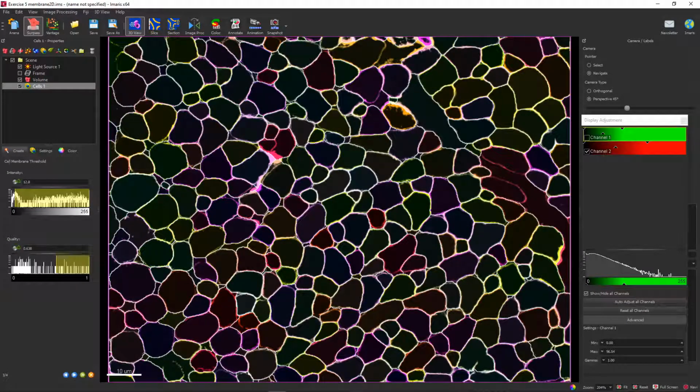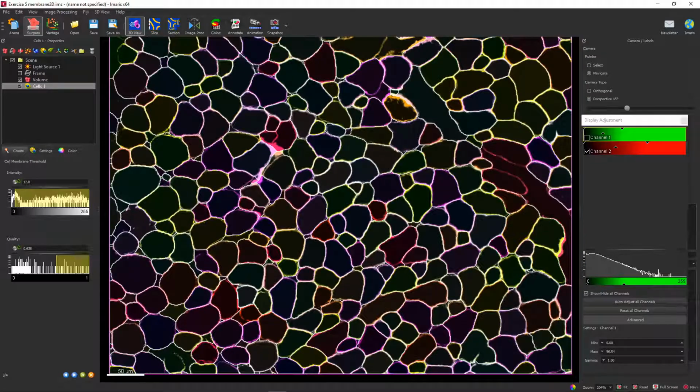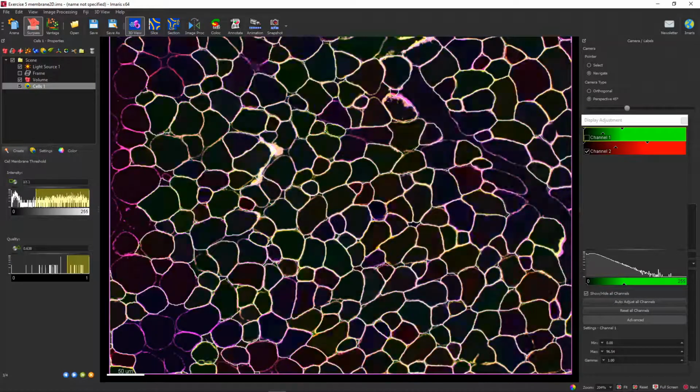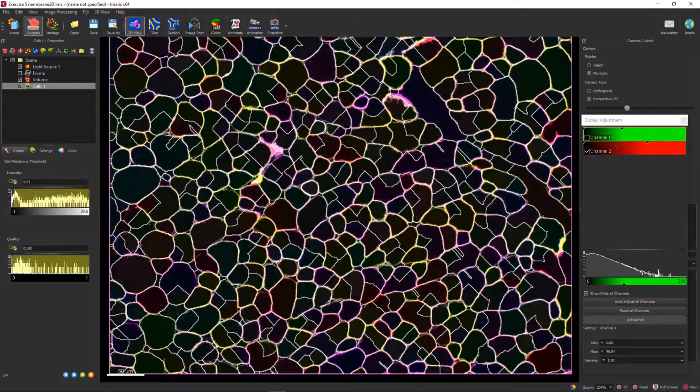And here we can see that once we select correct parameters, we can get pretty nice results already. In any case, we have these 2 sliders where we can select the threshold. So first, let's go with the intensity. Yeah, let's put it all the way to the right. And now let's just get the cells we are interested in. Nicely segmented. I think I can go all the way to the settings where it was. Those looked very nice. And the quality, again, let's go to the extreme.